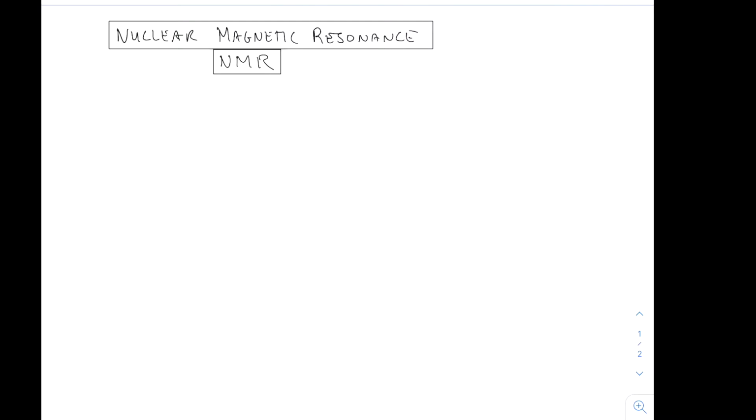All right, so today's discussion is going to be on nuclear magnetic resonance, also known as NMR. NMR is also called NMR spectroscopy, and that's because it uses radio waves, part of the electromagnetic spectrum. And so radio waves are going to be low energy.